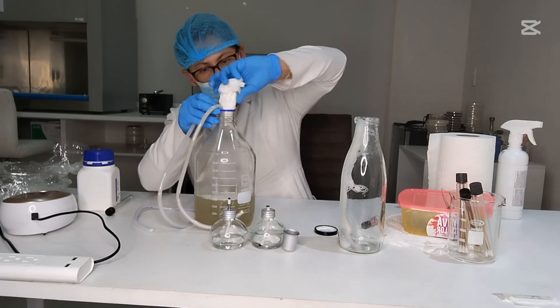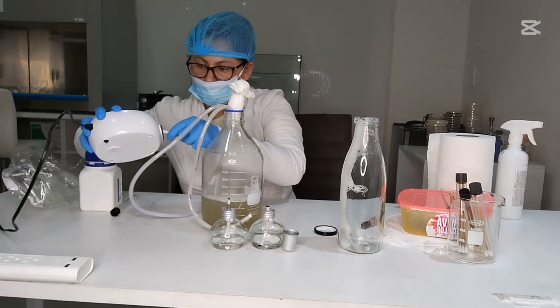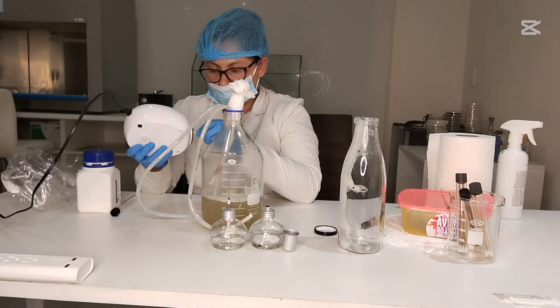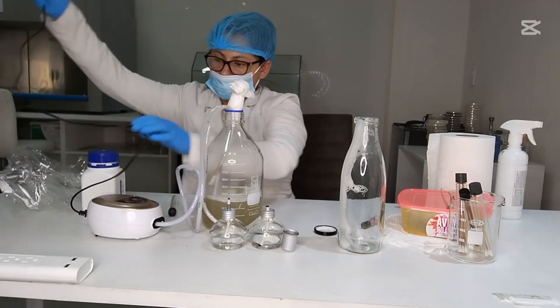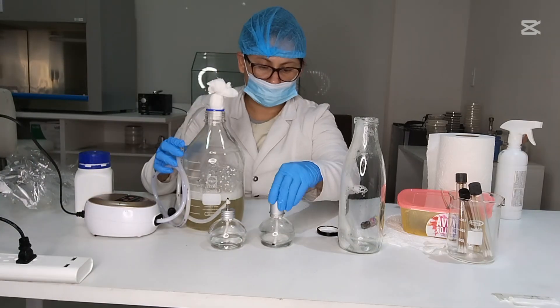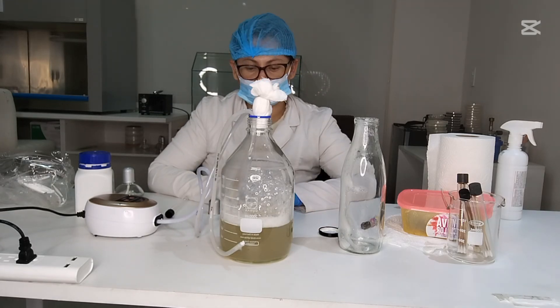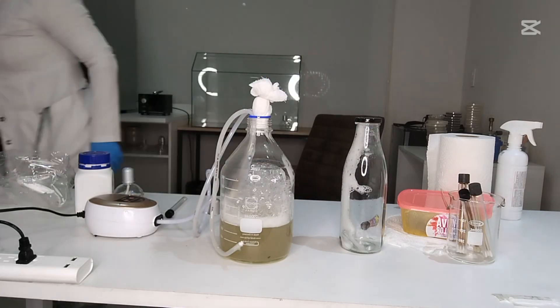Tips for success: avoid contamination by always sterilizing everything that contacts the culture. Monitor growth by looking for turbidity (cloudiness) as a sign of microbial growth. Harvest carefully — use sterile techniques to collect your microbes for use.